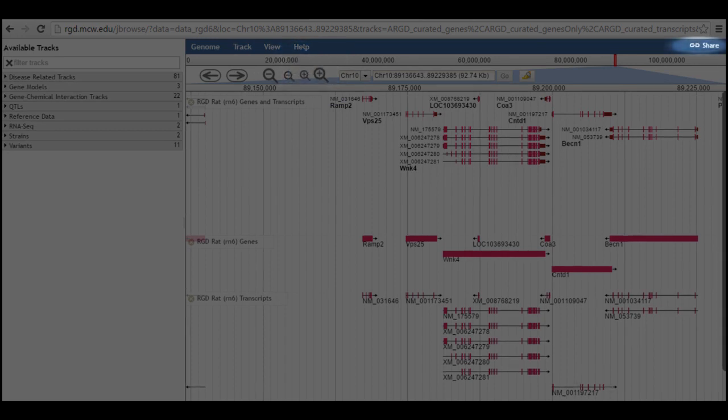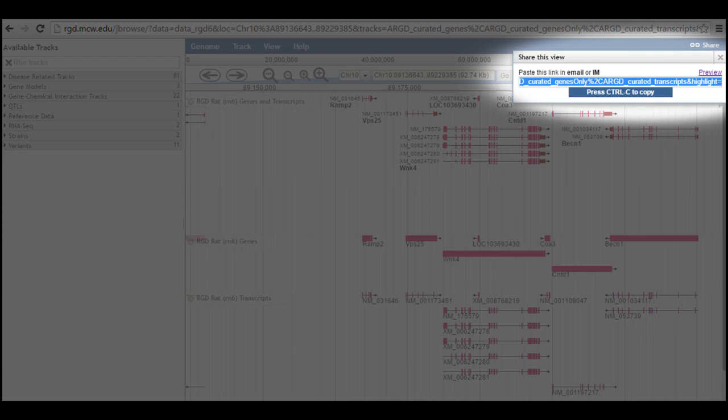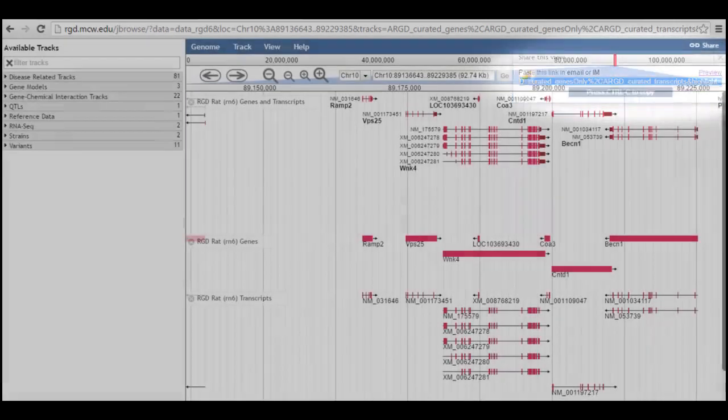The share link displays a URL for the exact genomic region and specific tracks that you are viewing, so you can share the exact view with a colleague or save it for your own records.